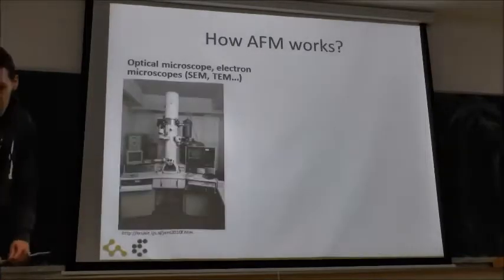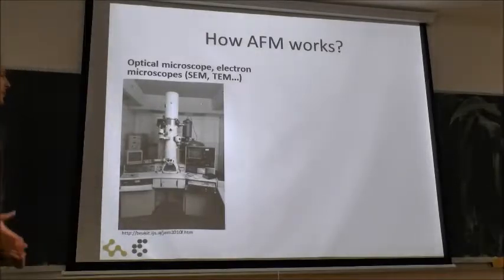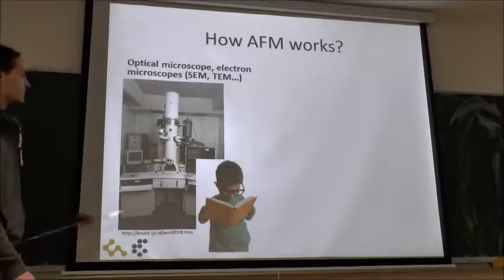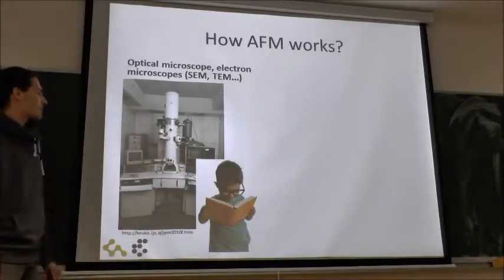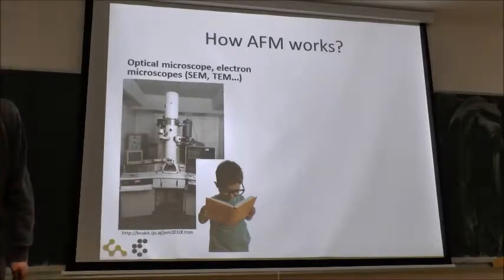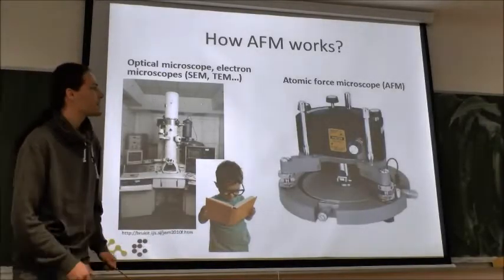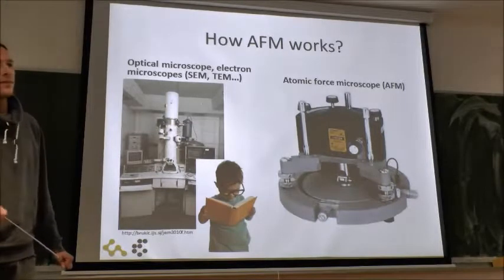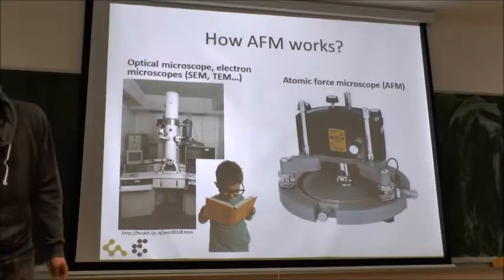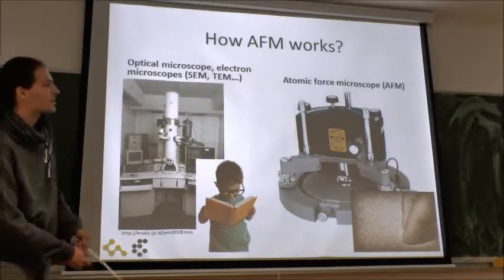I'm sure you all know the optical microscope or electron microscope. Here is one from the institute, and the principle is similar to reading: we observe the samples with light and then obtain some images. With atomic force microscopy, here's a similar example, one that we have at the institute, it's more like being blind and reading Braille.